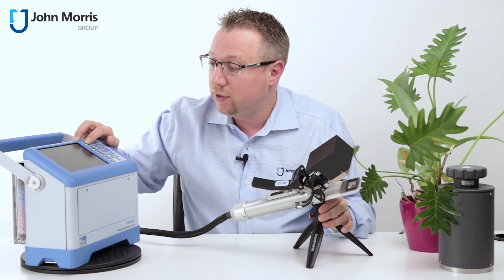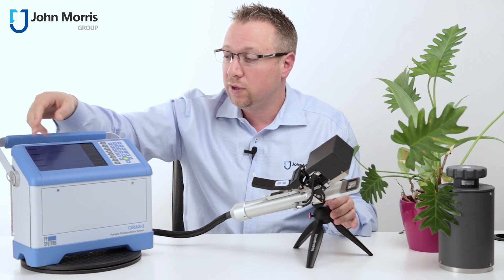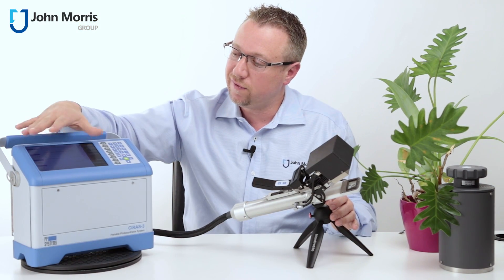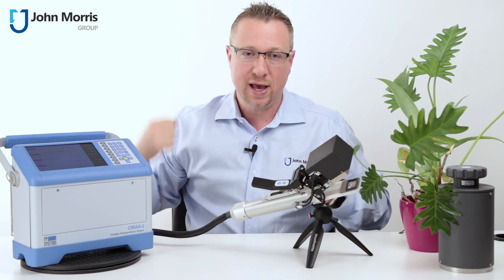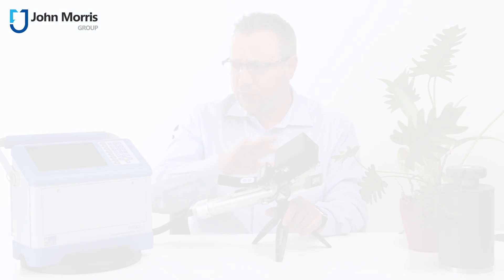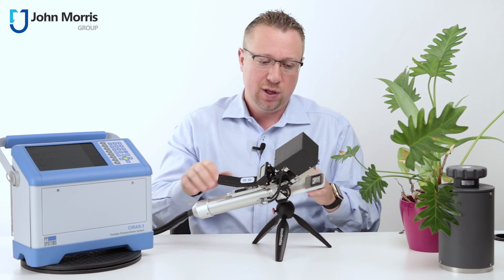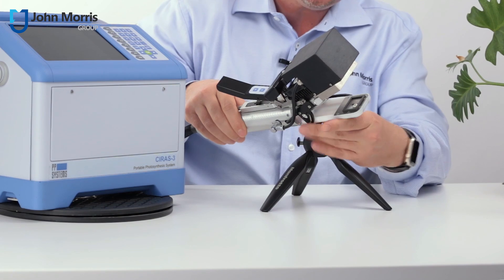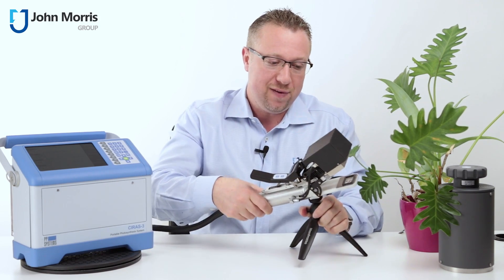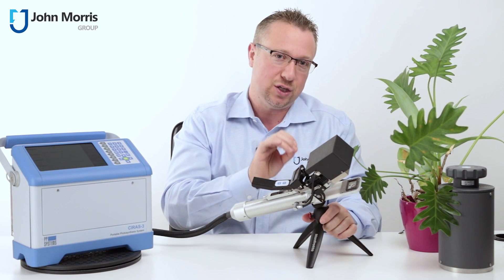It's got a fabulous display on this side here. You can set this up to be graphical. It's quite a big display and very easy to read. It's at an optimal angle so that if this device is sitting around your neck or you're carrying it, it's very easy to read. The first thing about this particular style of technology is that it's non-destructive in its sampling. The second thing is we have a very small little area here inside the cuvette, and if we were to put the leaf inside and then close it, we have a very short stabilization time.